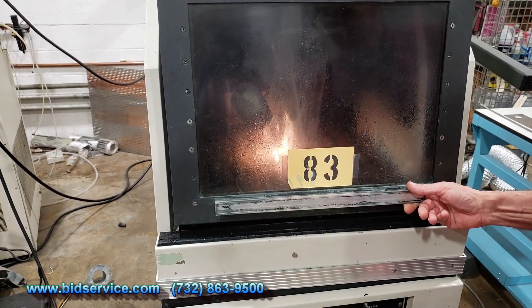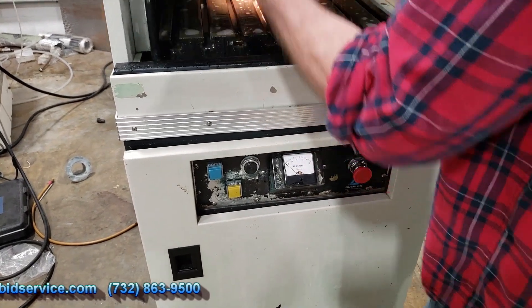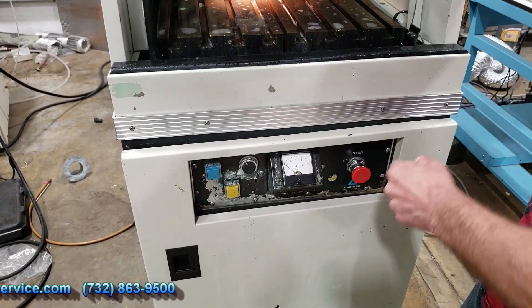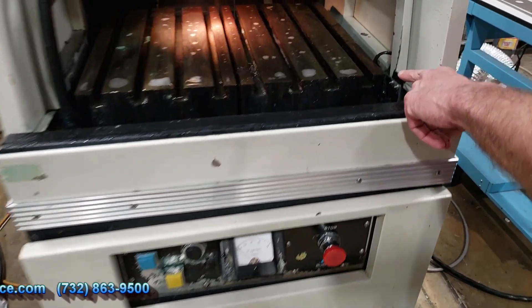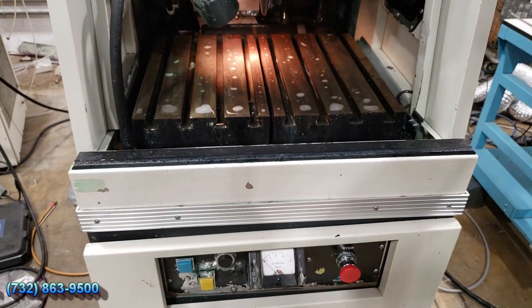You can stop the blade in the coolant by hitting the red emergency off button here. As I started to open the door, there is an interlock — a magnetic interlock — so that the blade will stop as you go ahead and open the door.